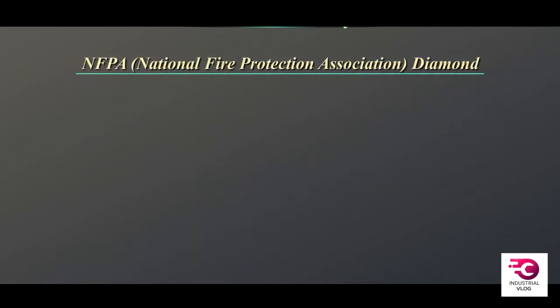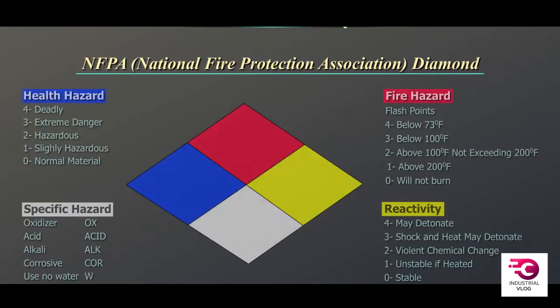The NFPA Diamond, National Fire Protection Association. Another warning system is NFPA. There are 4 diamonds within the one large diamond. Red indicates fire hazard, blue indicates health hazard, white indicates a specific hazard, and yellow indicates reactivity.